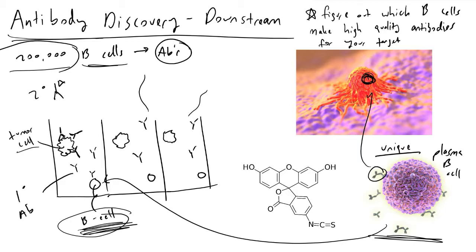But we have these secondary antibodies that look like this, and these secondary antibodies will have a high affinity for these primary antibodies. And so if your primary antibodies have been localized inside of a pen, because we're able to keep everything inside this pen using the Berkeley Lights technology, we can have these secondary antibodies come in and then stick onto the primary antibodies, and they will contain this little flag thingy I'm trying to draw here. And this little flag thingy is my representation of a fluorophore.